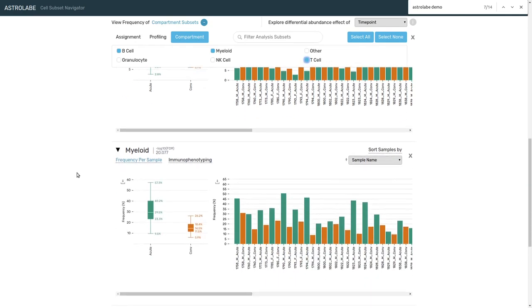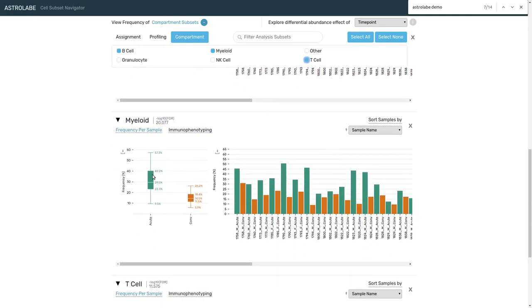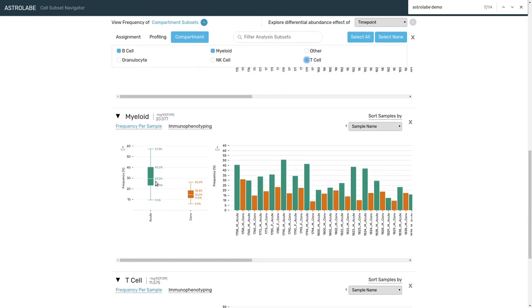Scrolling down, looking at myeloids, we see the frequency of these cells has dropped by quite a bit from around 30% to around 15% in the convalescent time point.